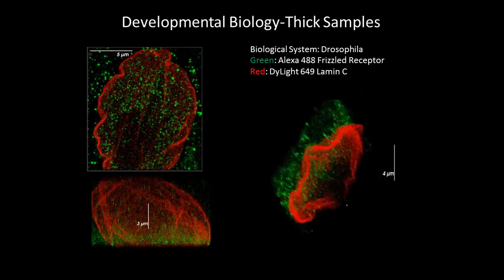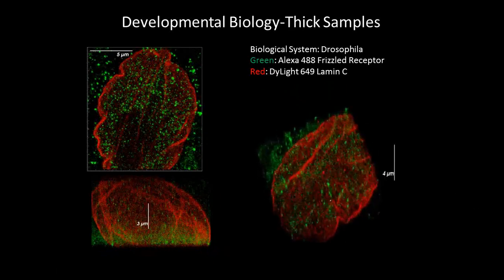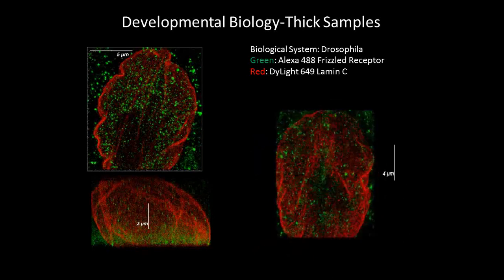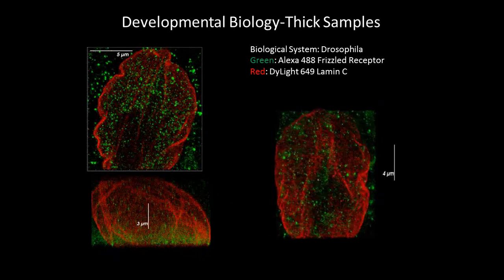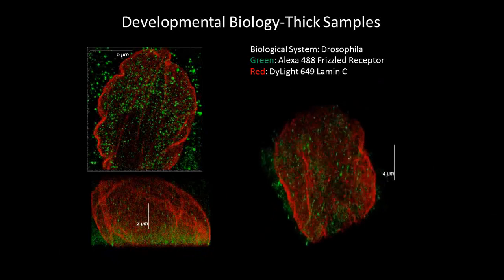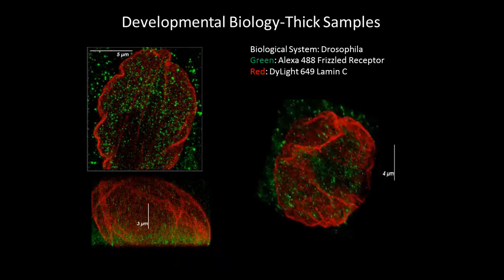We did sequential imaging, as you'll find for most of the organic dyes, so you do have to image them in a sequential fashion. We were also able to image fairly deep. This is a thin stack that we took, but we were also able to image about 200 microns into this particular prep. Sean said he had to really optimize and block really well so that he didn't have a lot of non-specific staining, and make sure that the primary and secondary concentrations were optimal.